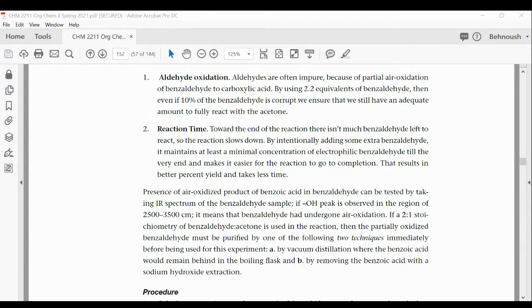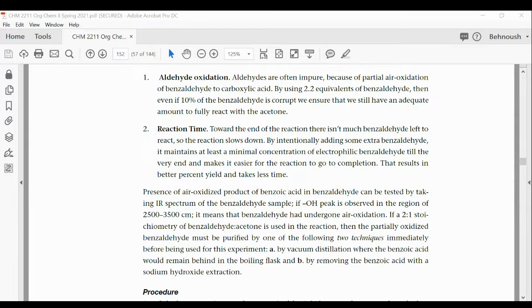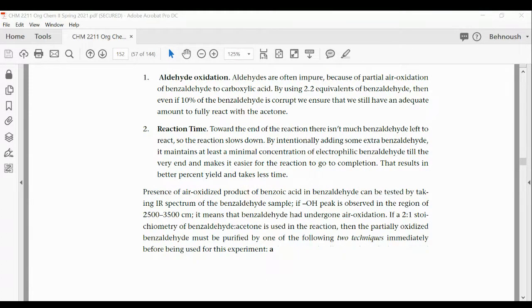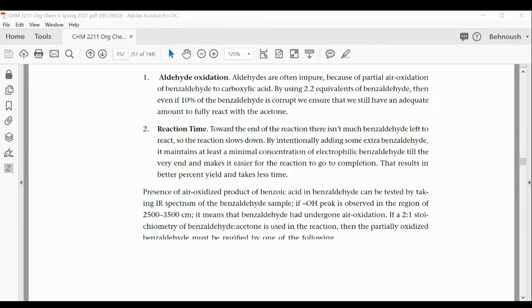Thank you. And also melting point. The closer the melting point of your final product is to the literature value, that means your sample is identified and it is pure. Thank you. Because melting point can identify and also determine the purity of the sample. If the melting point comes anywhere between like 80 to 120, it's confirmed that the product has formed, but if it's close to the literature value and is sharp, that means your compound is pure. Thank you. You're welcome. Any other questions?